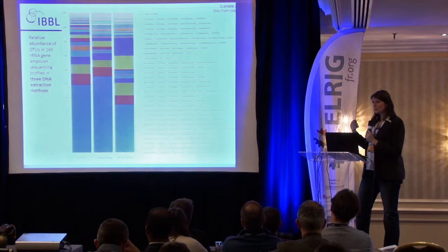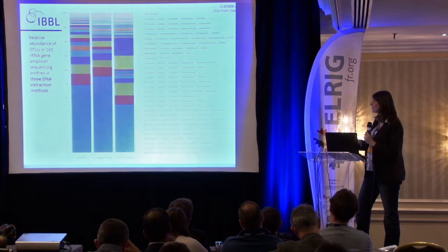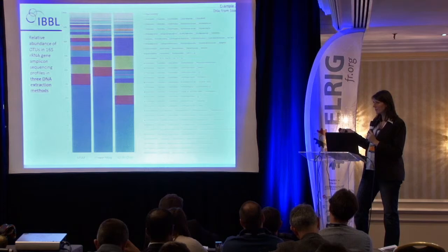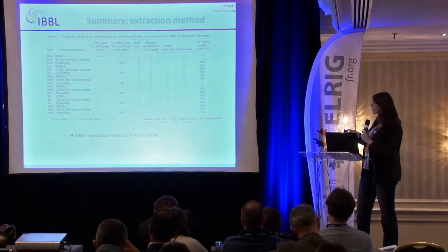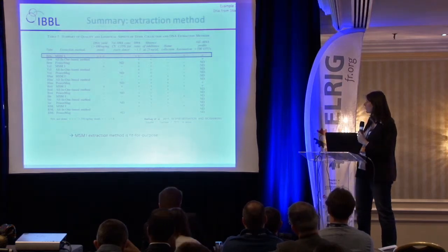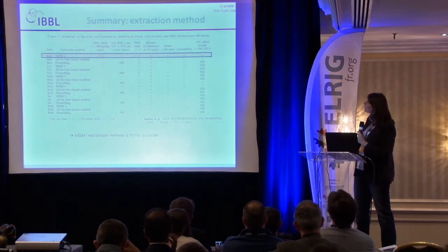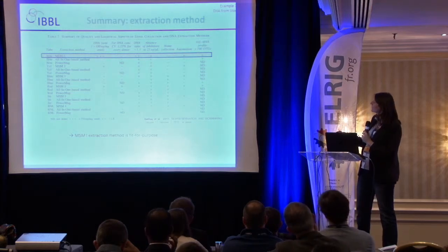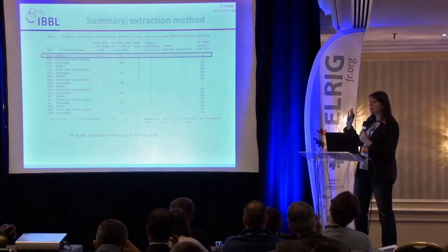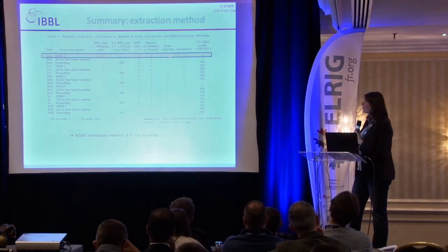So this brings us to the conclusion that the extraction method is a very important factor. And in-house, we selected the method which gave us the best quality results. As a summary for this study, we could say that the MSM I, the instrument I have shown quite often until now, really had good quality samples. However, it was combined with this plain tube, which is called the brown tube, but this is a detail. This is a plain tube. It was not possible to do home collection.